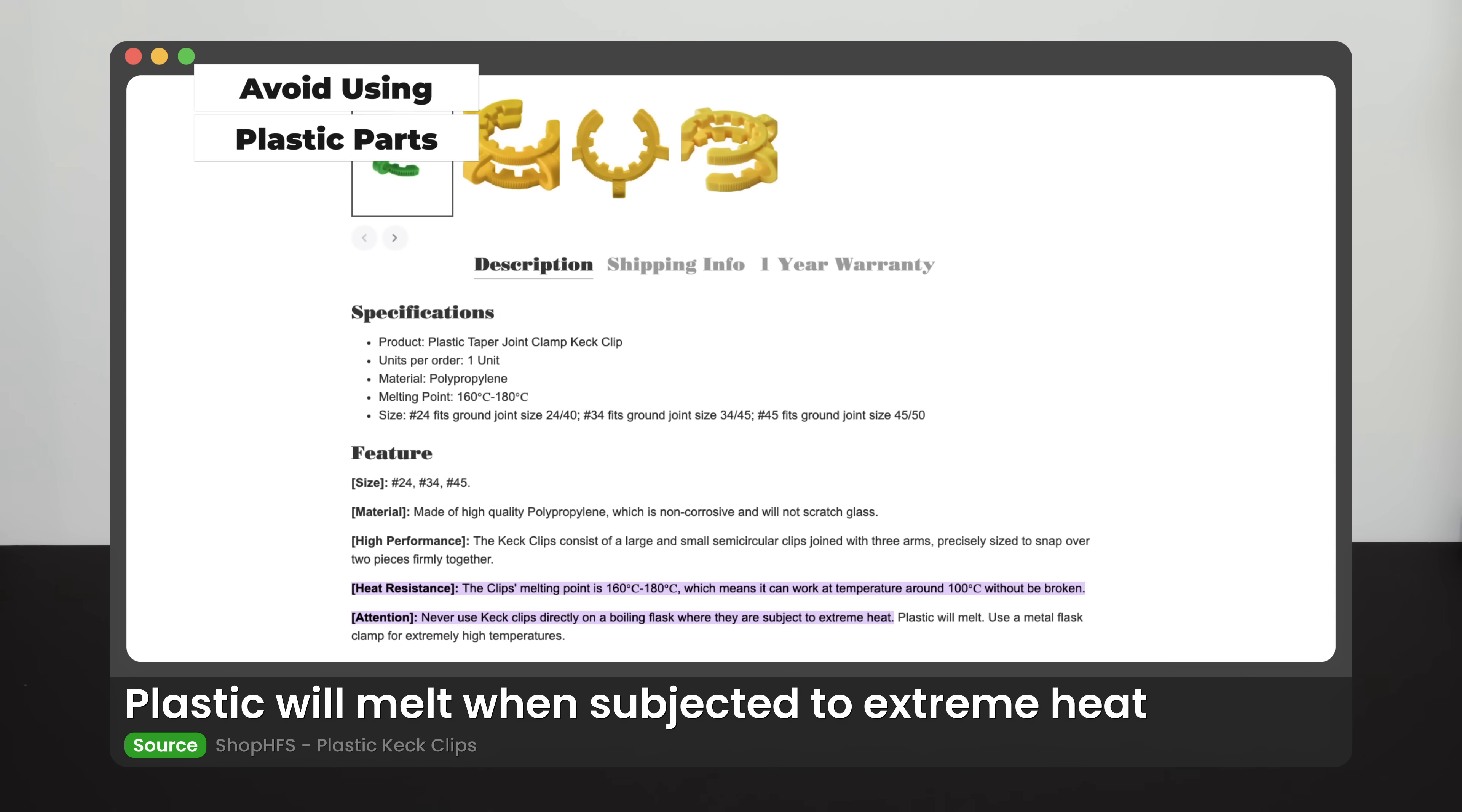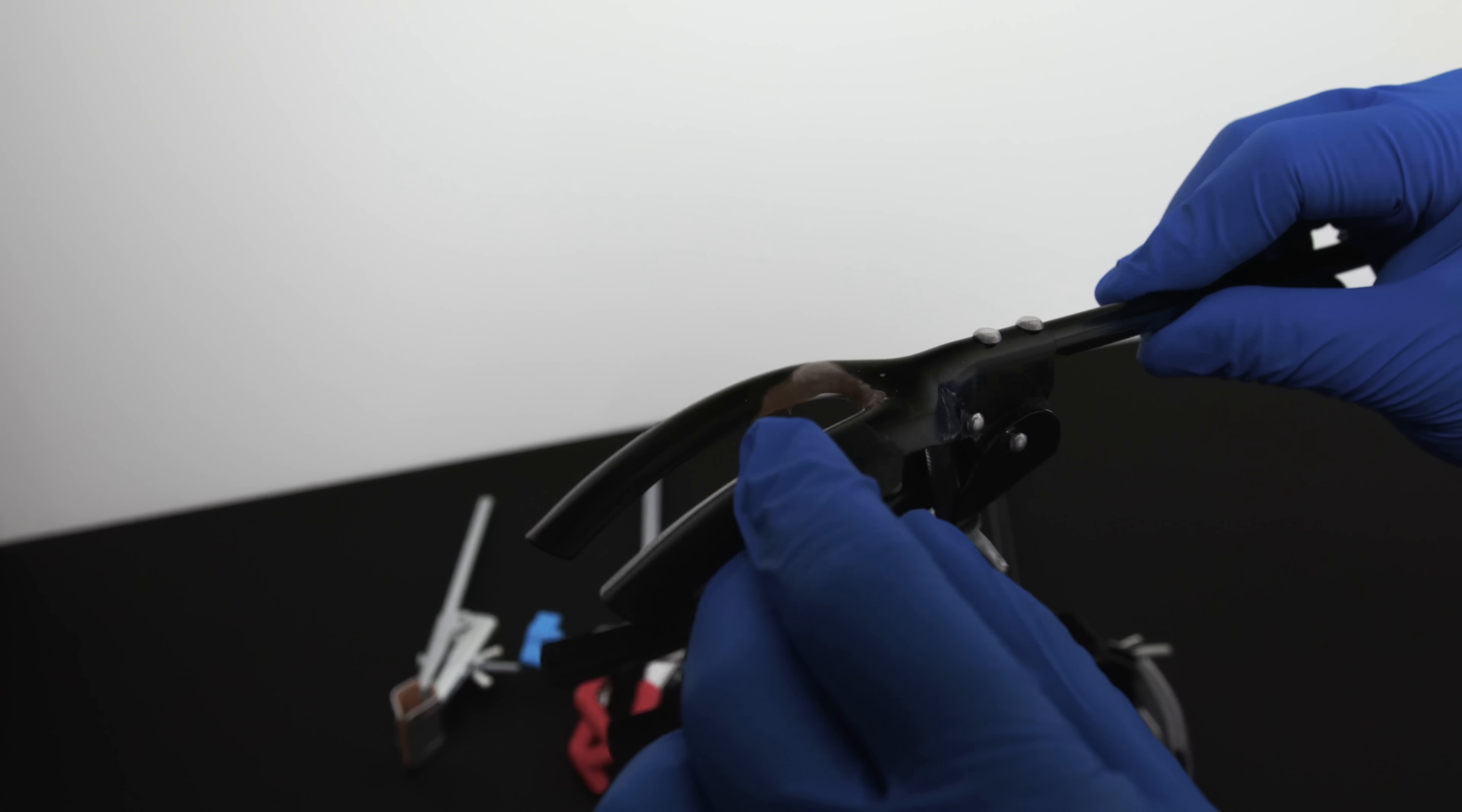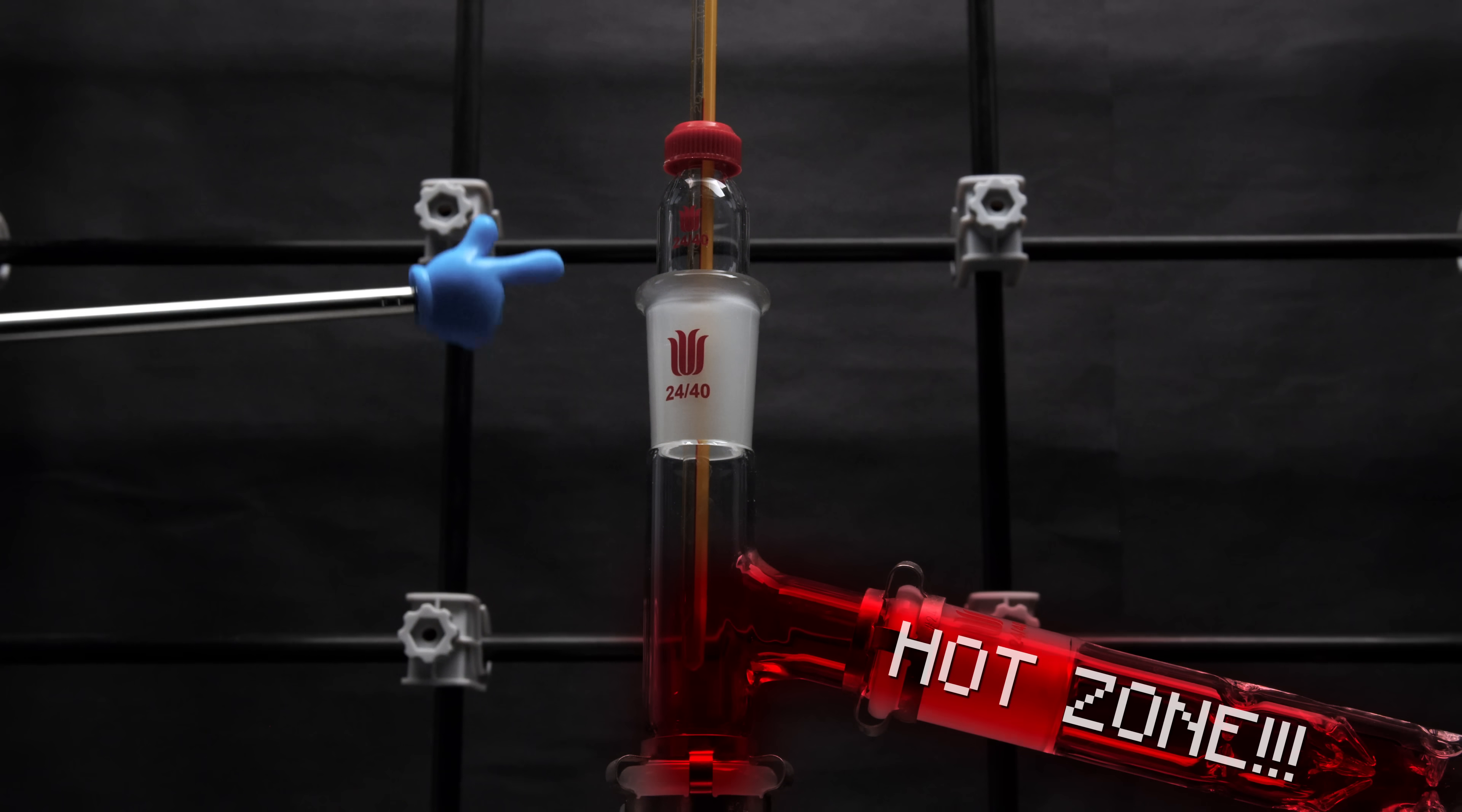In case you didn't already know, you must avoid using plastic parts, including plastic clamps or keck clips in the setup. They can't withstand the heat from the distillation and will melt right away. Also note that the paint or coating on some of your clamps might melt too. I strategically clamped my apparatus in a position that is less heated, so the coating on my clamps is less likely to melt.